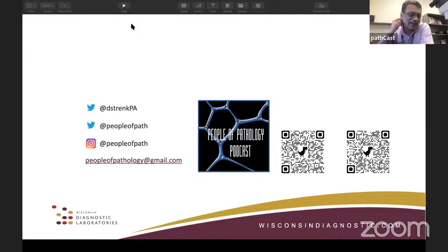Yeah. Thank you, Mr. Strenk. I think this is something very important that Mr. Strenk has mentioned to all of us: whatever color code you are using, keep it consistent, so that in that lab, at least, you use the same color code for that specimen all the time. That makes it easy for everybody. And also, one thing to be kept in mind is that whatever color code we use, we need to mention it in the gross description. Otherwise, it's not easy for anyone to remember later which color meant what. So that we should never forget.